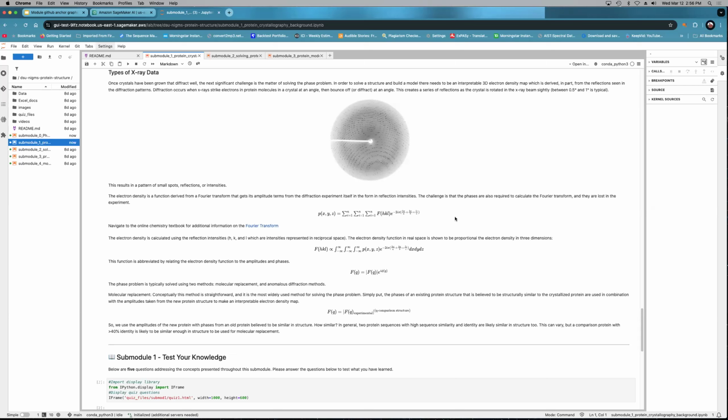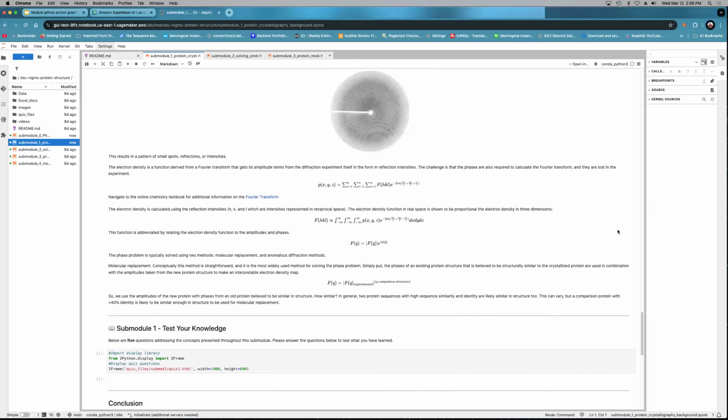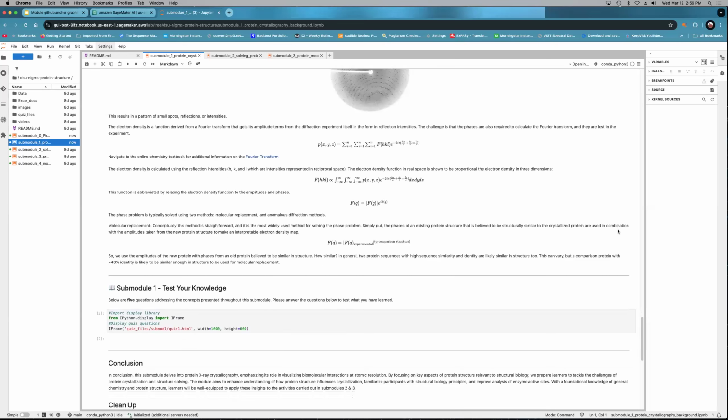The first data set I ever collected many years ago took 6 hours. It was at a relatively weak beam line, but it produced a great structure that I got a lot of mileage out of. And for a lot of other people too, the data collection part really is fast, which is great for high throughput. Really, the time-consuming part is taking that data and turning it into an actual structure, model building and refinement.